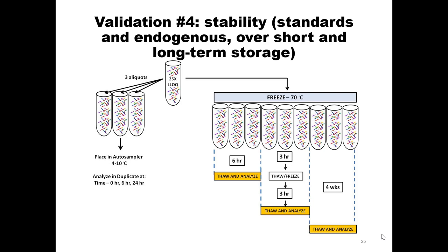If it's already how you have the sample, you've got to do what you've got to do, right? Does anybody do similar experiments in a slightly different way? This is just the CPTAC guideline, but it probably for me was the one that made the most sense because I was already kind of doing freeze-thaw tests like this anyway.